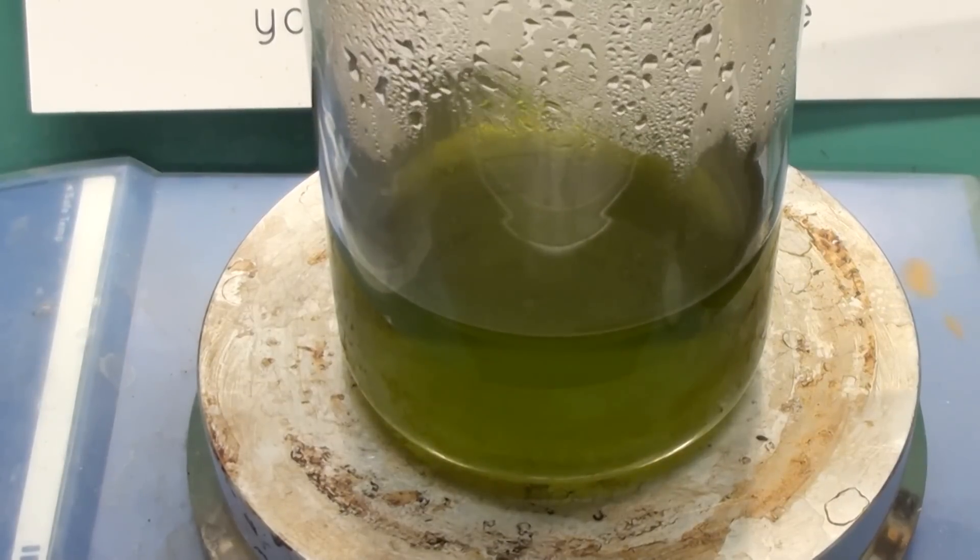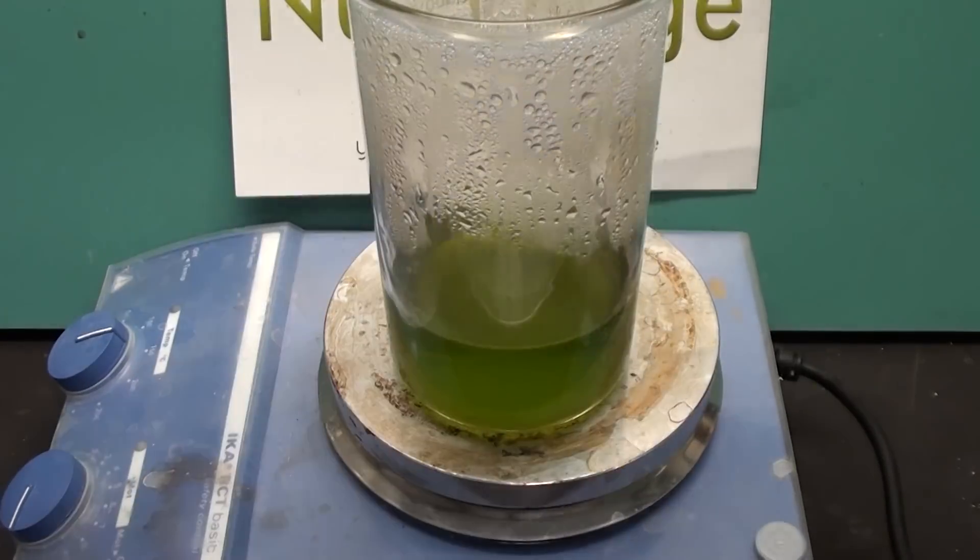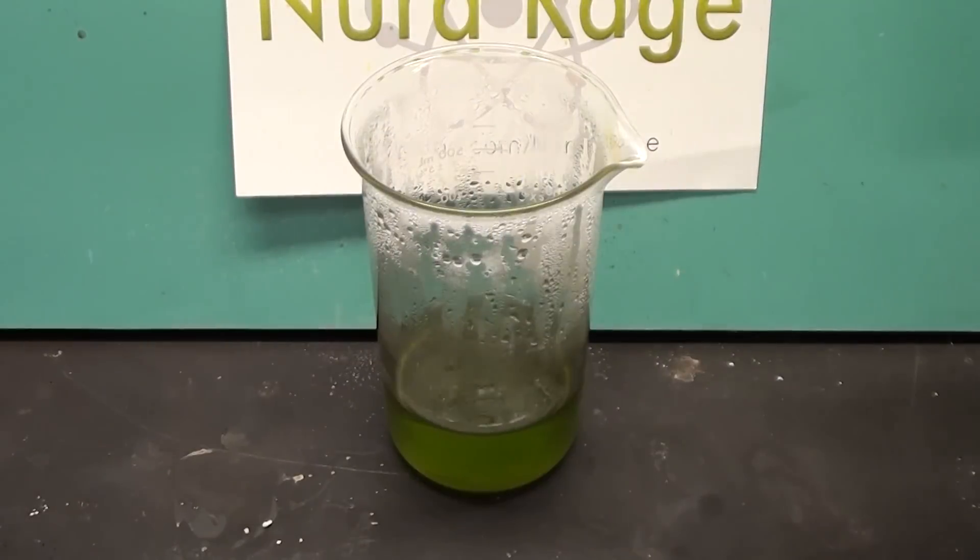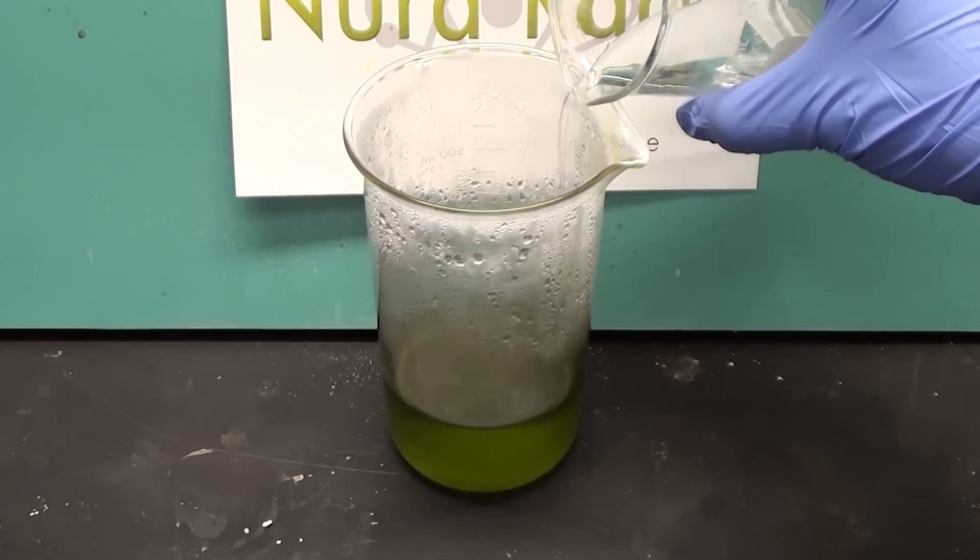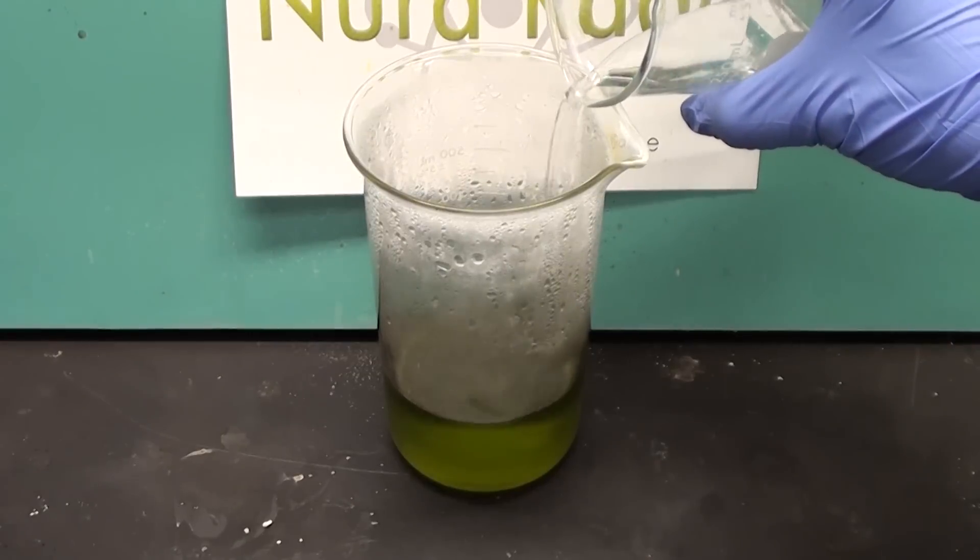Once the iron is completely dissolved, turn off the heating and let it cool. If any of the acid evaporated or boiled off, just top it up with more acid until the total volume is back to 200mL.